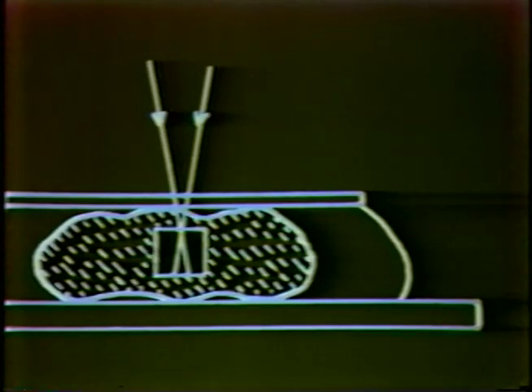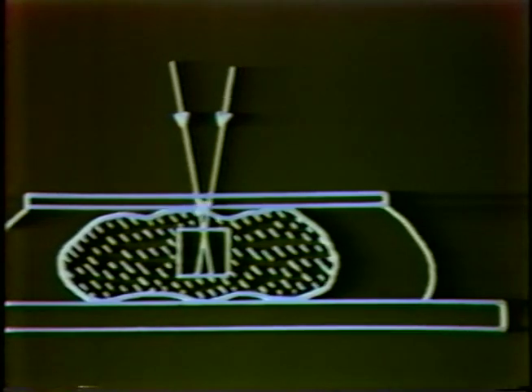At the outset, I said that a very important thing would be three-dimensional imaging. In all the confocal microscopes, it's now easy to do this. It's particularly easy in the tandem scanning microscope. The basis of the procedure is simply this. I've drawn here a biological specimen with a cover slip and a slide which has exaggerated depth. And say we want to image this three-dimensional volume inside the sample. All we need to do is to start recording one photograph with the stage focused here, and then keep on changing the focus while we record that photograph and stop the exposure there. Wind on, take another photograph starting at the same focal plane and focus down like that.